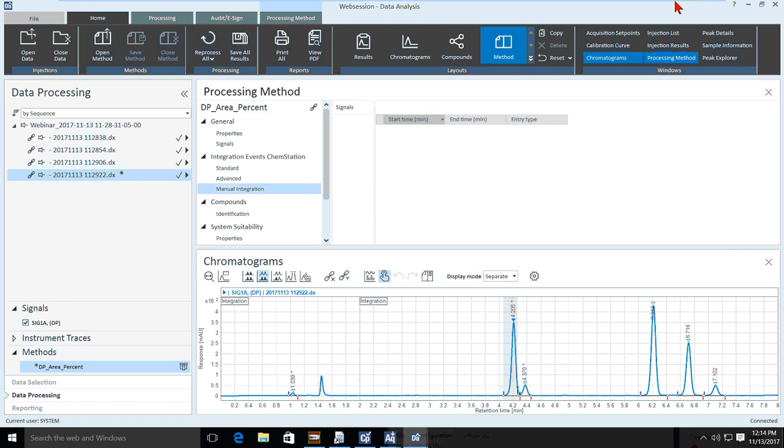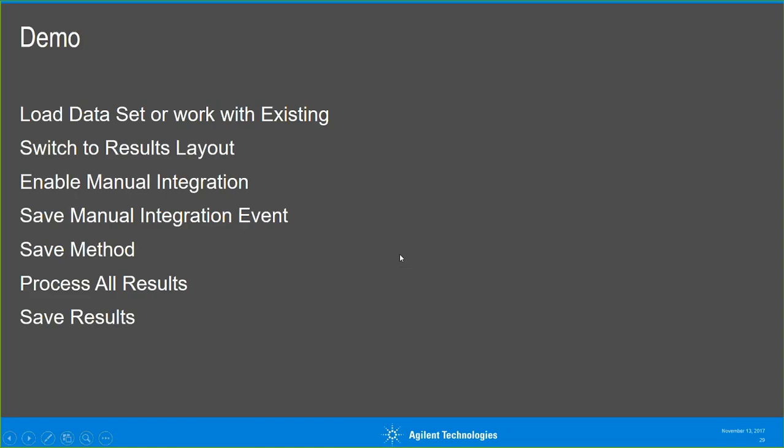All right, so with that, are there any questions on manual? Well, before this, let me show you. Again, you have to deselect the mouse, right? So when I'm done manually integrating, you just need to remember to go back and deactivate the manual integration. All right, and so now you can go on and work through and zoom in, zoom out, do what you need to do with the standard chromatogram that you would otherwise. Okay, are there any questions on this?